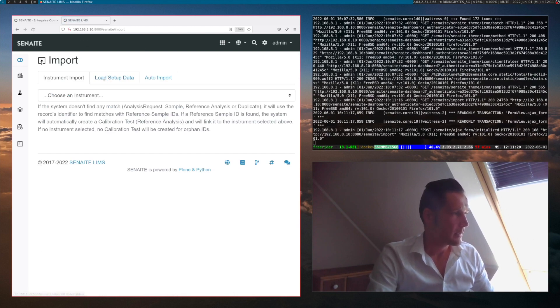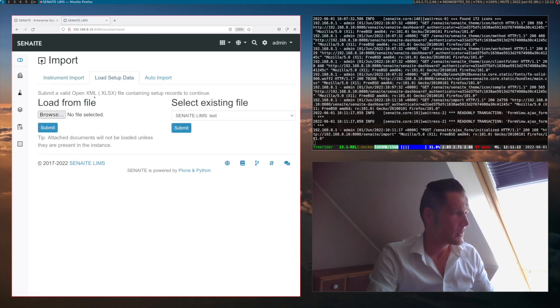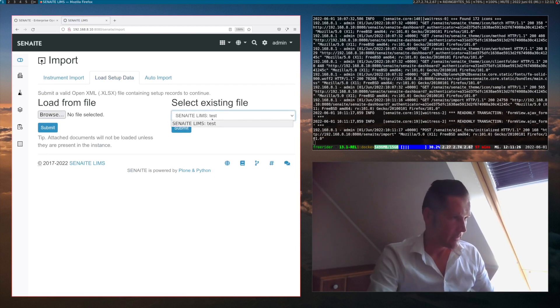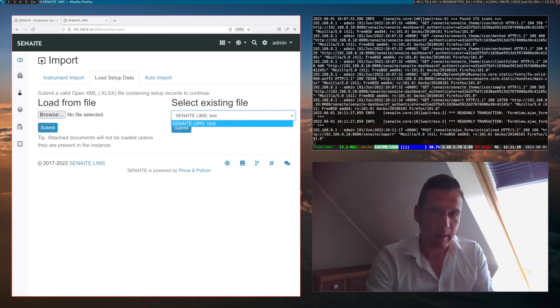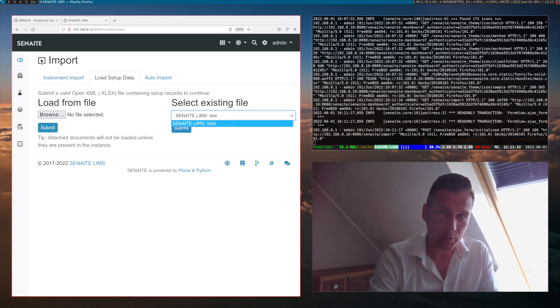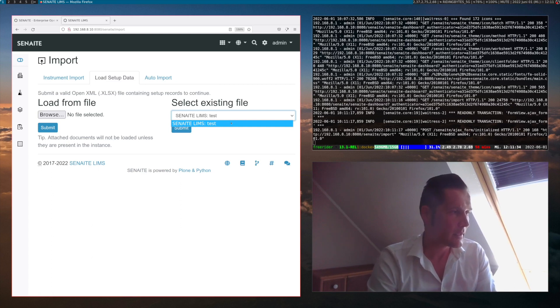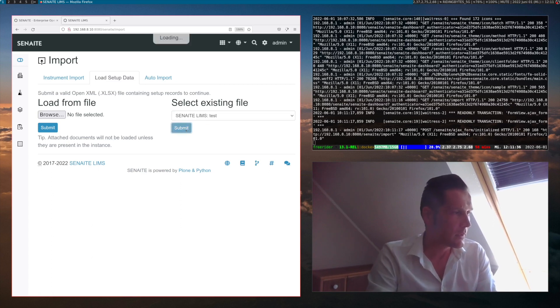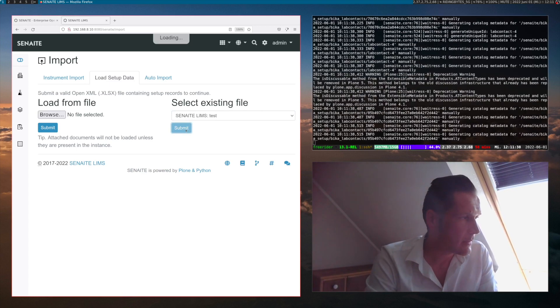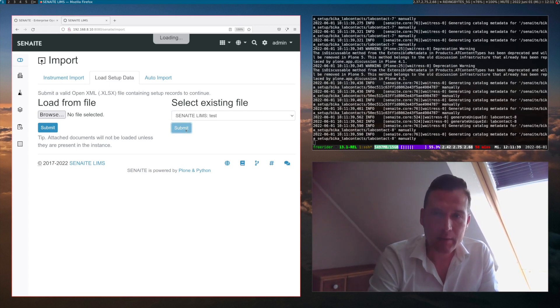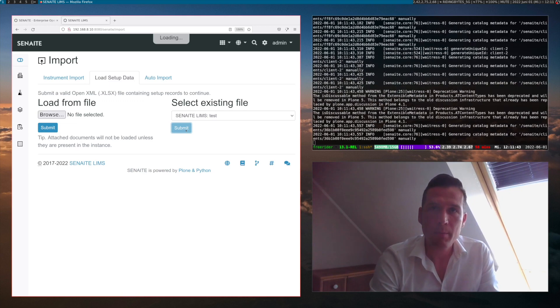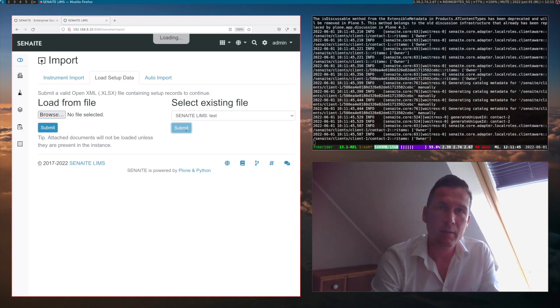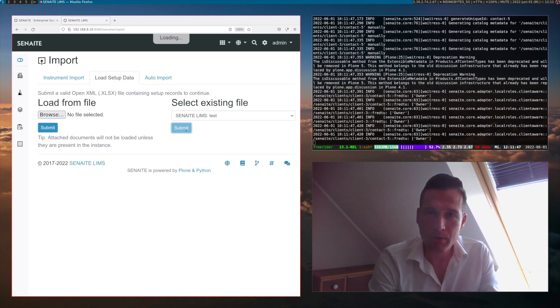There we see already in the middle tab that we can load some setup data — load from file or select existing file. The existing file is one that already exists, an Excel file that lives in the core code base. So basically, we can just use this one and click the submit button.